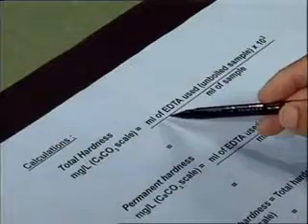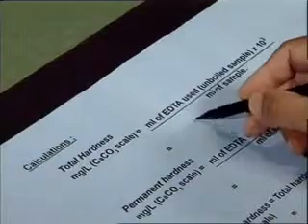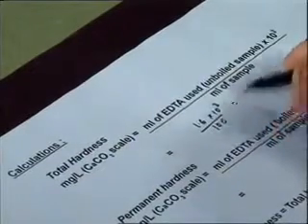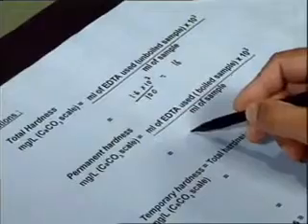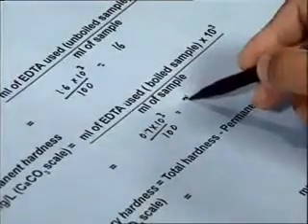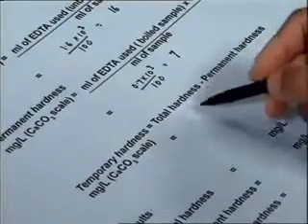Total hardness on calcium carbonate scale is measured as ml of EDTA used for unboiled sample into 10 to power 3 divided by ml of sample, which in this case is found to be 16 mg per liter. A similar formula is used to calculate permanent hardness, but for the ml of EDTA used for boiled sample. And temporary hardness is found as the difference between the total and permanent hardness.